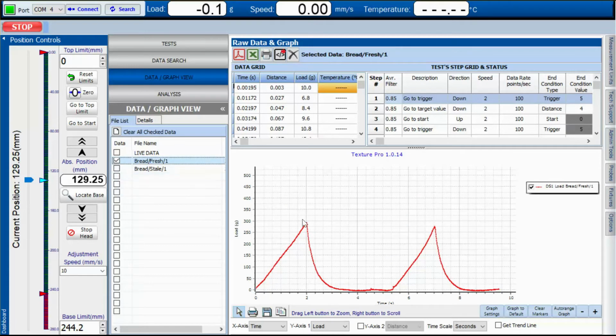The first cycle and the second cycle are almost identical. They're quite close. So there is a spring back on the second cycle, which means that it's springy. This is how we will compare between a stale and a fresh bread, and also in the same manner for a shelf life test. So the conclusion is that this is very simple to follow and provides valuable data related to both the staling and compositional properties of bread.